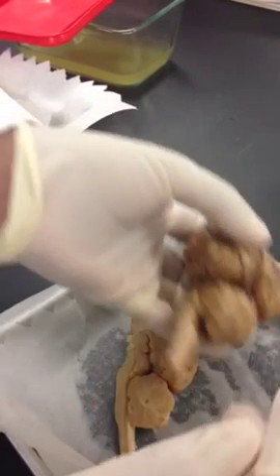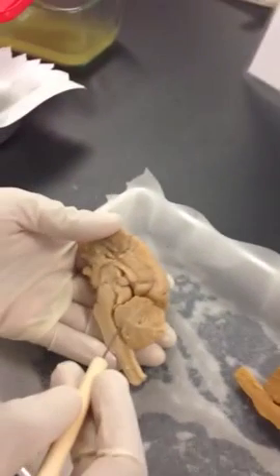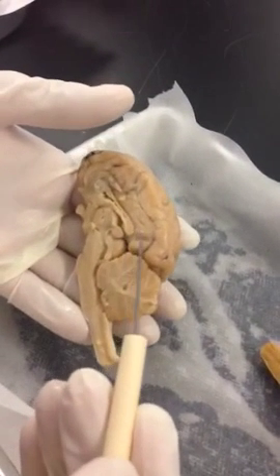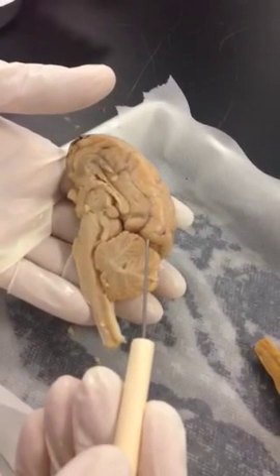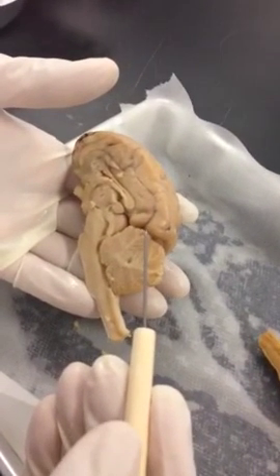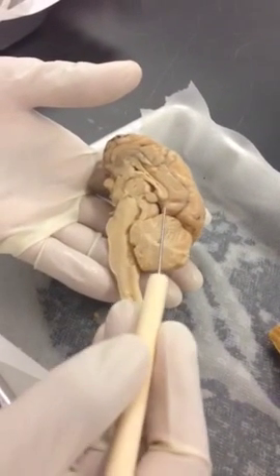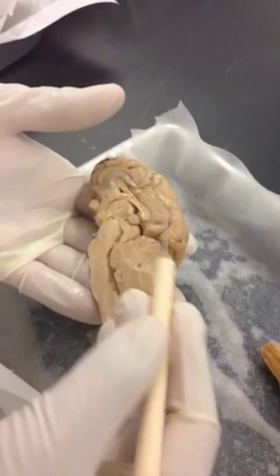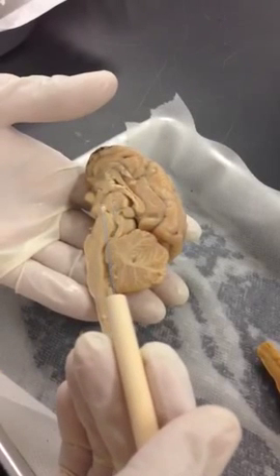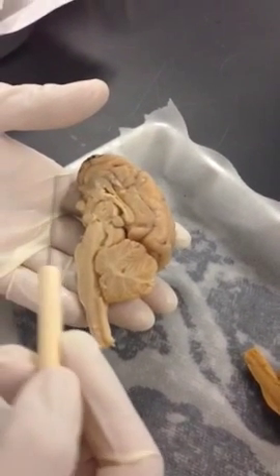But if you cut open and look in the sagittal view, this is what you see. In the brain, anywhere you see whitish or light colored area, that represents your white matter. Because of a lot of myelin, you have that whitish or light color. Compared to the surroundings, which are more dark, the darker color comes from absence of myelin. If there is no myelin, that's your gray matter, white matter and gray matter.